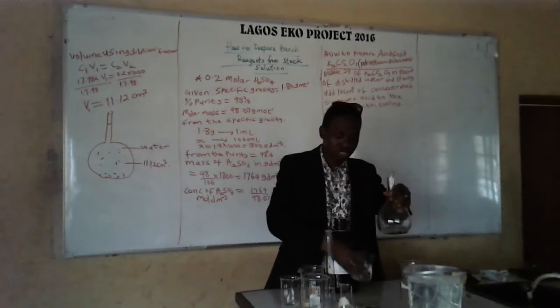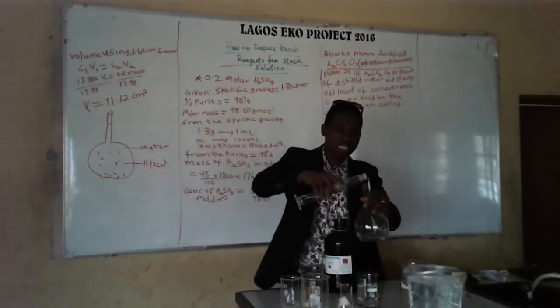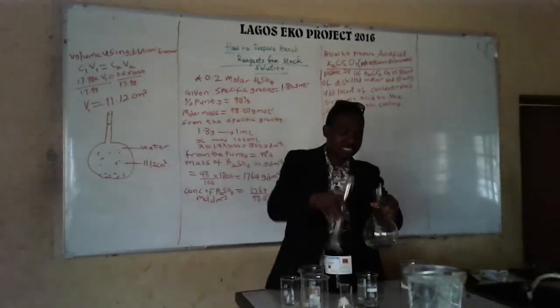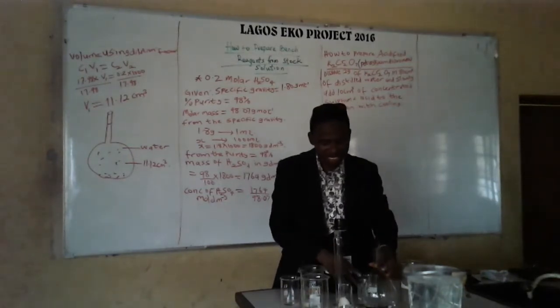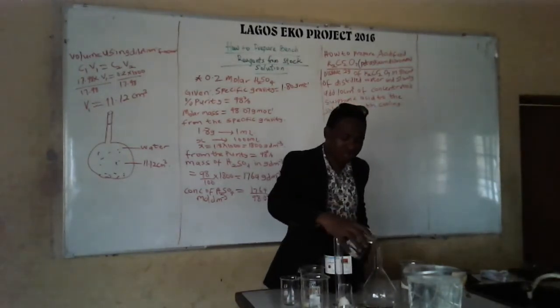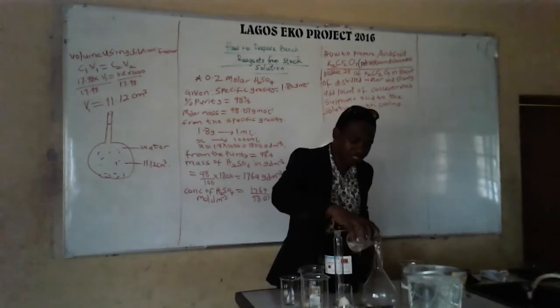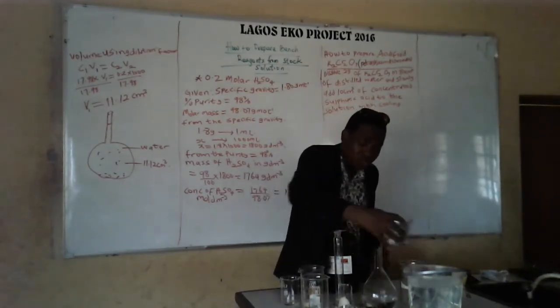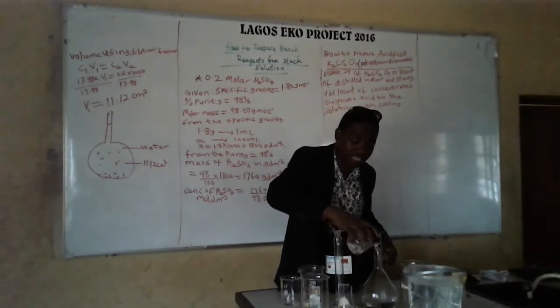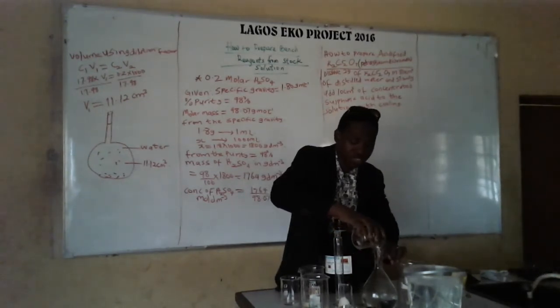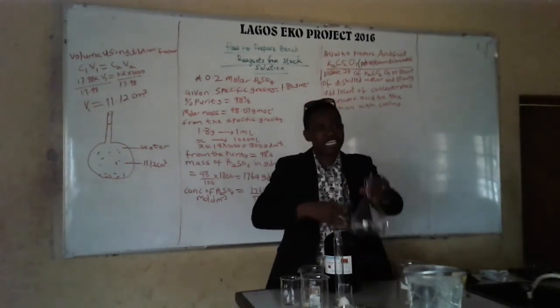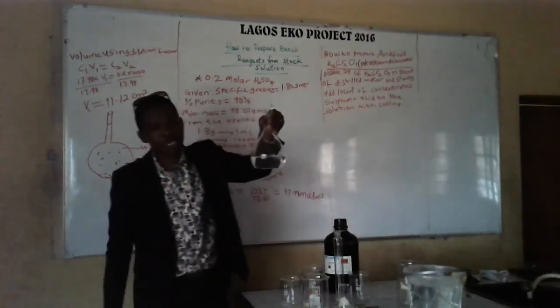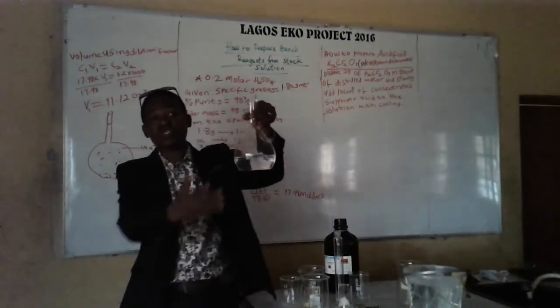I have this small amount of water inside the flask already. Then I carefully add my measured acid inside. After that, I fill it up to the meniscus mark. What you have at the end is your prepared H₂SO₄ standard solution at 0.2 mol/L, which you can use.